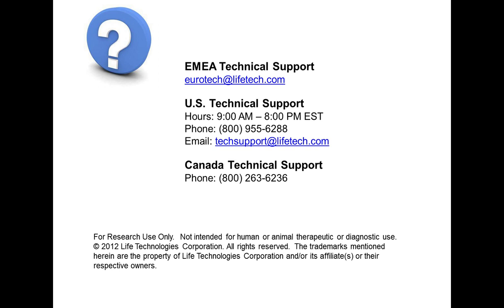There's a question about making a gate on a population and looking at different samples and wanting to change the gate for each sample or increasing the gate size. And I think this is something that you'll have to determine for your own experiment. But if you're in the course of an experiment, the population of interest might change. So I think that's something that is possible to do.